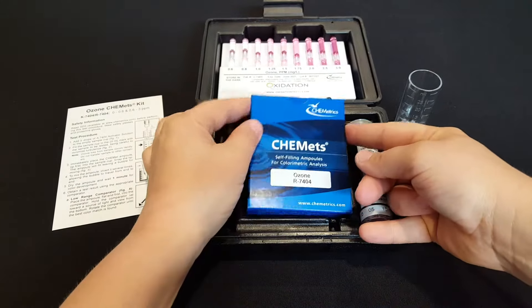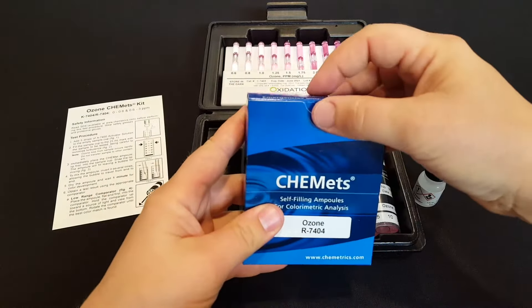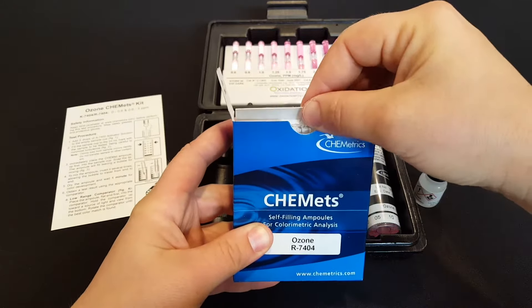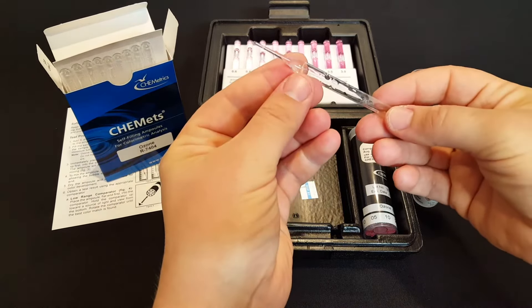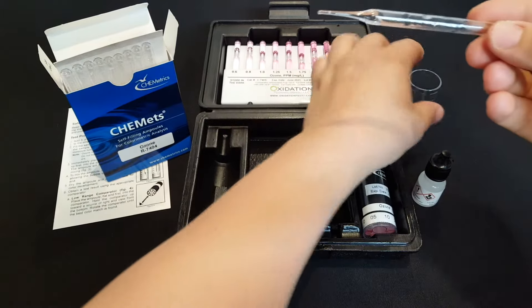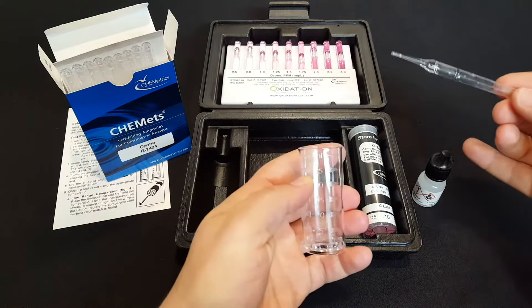As part of the chemical reaction you have a package of test ampules — there are 30 ampules in this box. Inside each ampule there's a small amount of chemical solution which will react with the dissolved ozone and the activator solution.